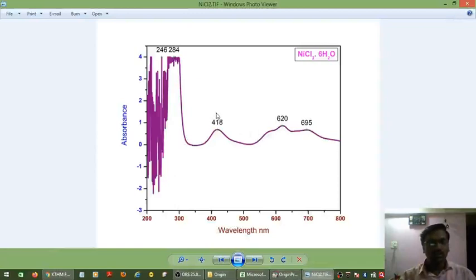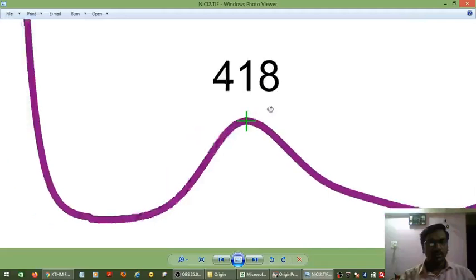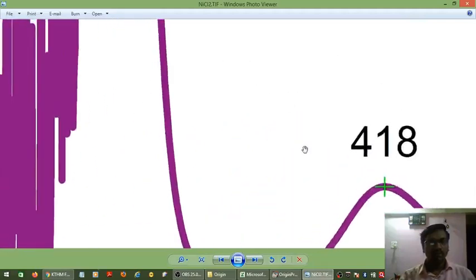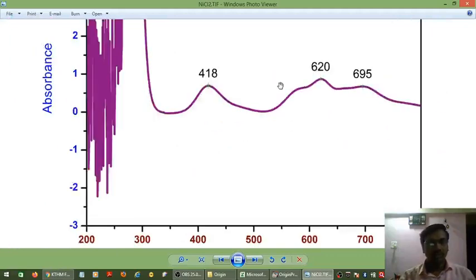Now you can copy this and paste it in your Word document. You can crop this, but you will not have any change in the quality of your picture. If you zoom in, you will have the same look as it is over there.